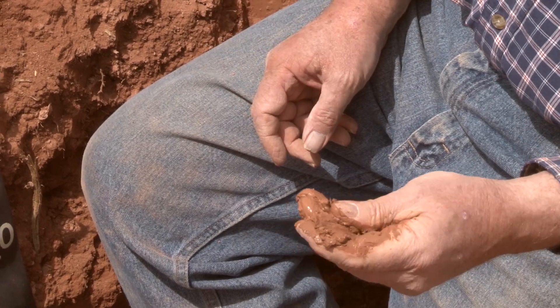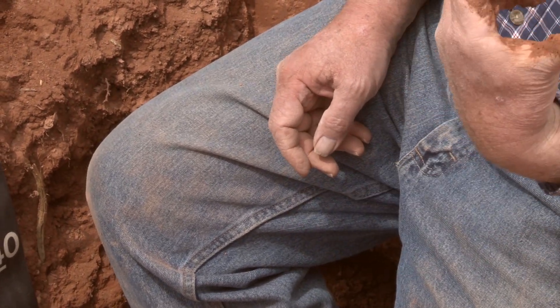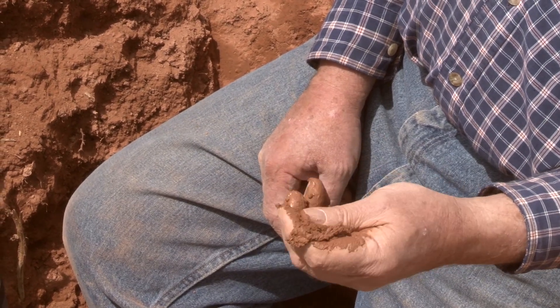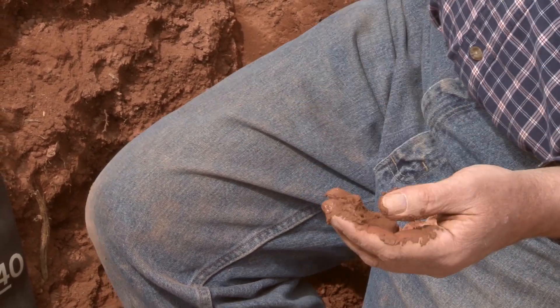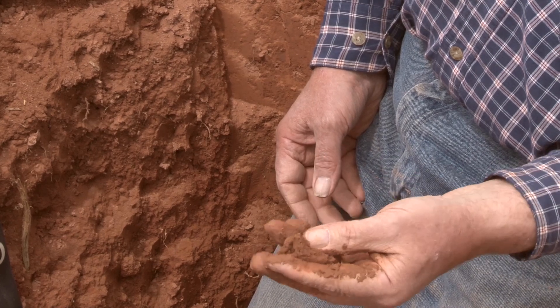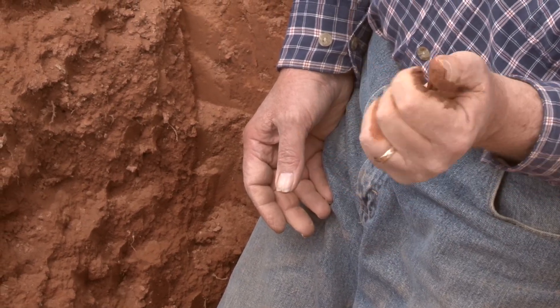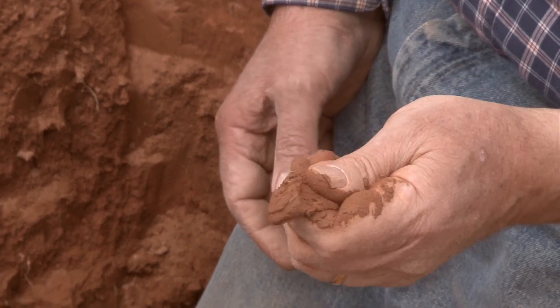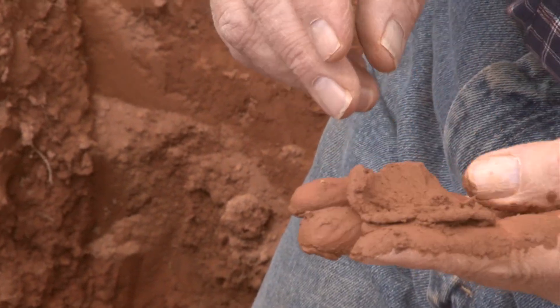Sand is gritty, silt is smooth, and clay is sticky. On this particular one it's pretty silty, so because it's very smooth — in fact there's hardly any sand at all in this texture. So if you've eliminated all of the sandy textures, you've got silt and clay to consider. It's smooth, so it's dominated by silt, and it'll do a short but rough ribbon when you squeeze it between your fingers. So this particular sample comes out as a silt loam.